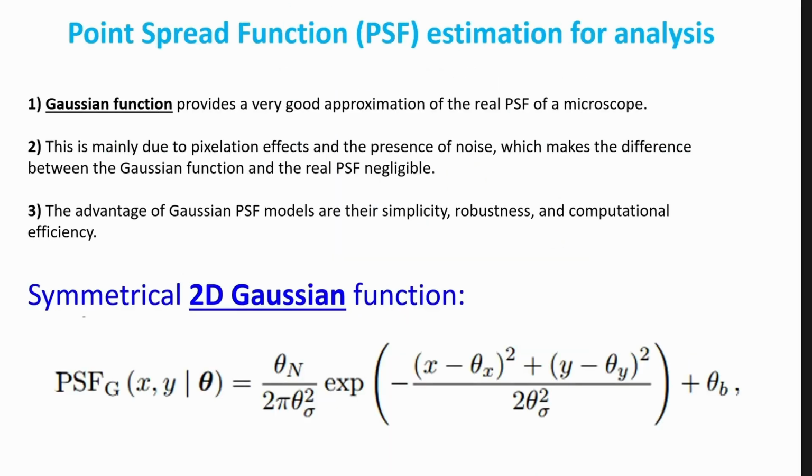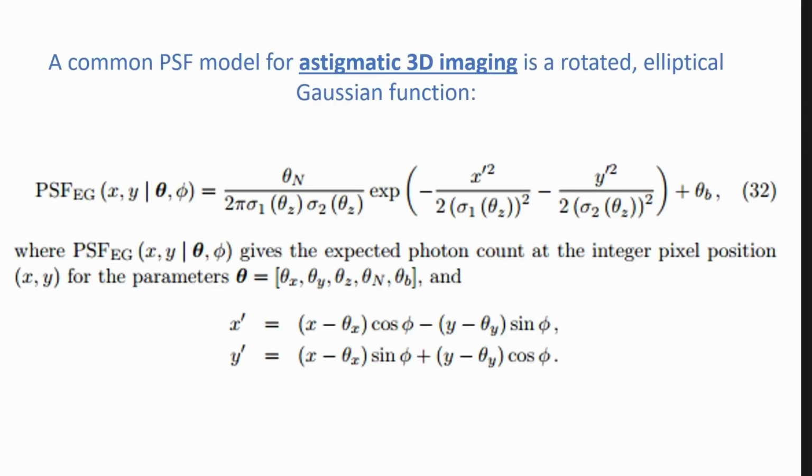Okay, in terms of the fitting, typically it's a Gaussian function. Of course, in XY you use a two-dimensional Gaussian, which you can simply put on your GPU and then do a very quick calculation. So with a modern GPU, this actually is an almost live method where you can monitor the molecules as they flash and fit them basically online.